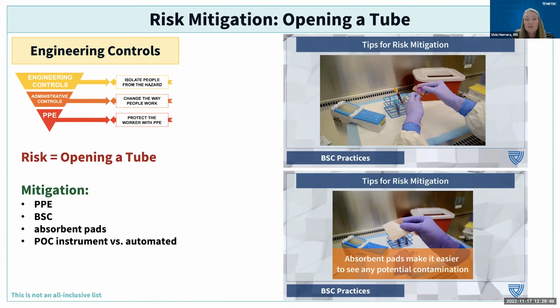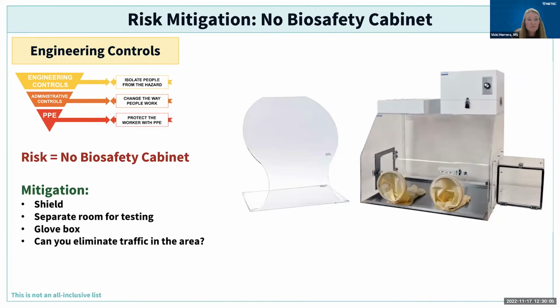It also makes the potential contamination easier to see. And again, maybe utilizing point of care instrumentation that could be put in a biosafety cabinet versus putting something on an automated system. All right, next slide, please.